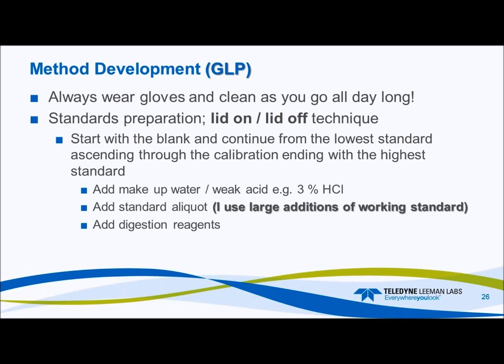GLP, so we always wear gloves and you clean as you go all day long. And I use a very simple technique for preparing standards. I call it the lid on, lid off technique. And I start with the blank and I continue from the lowest to the highest. So I'll add my makeup, whatever I need to bring it up to volume. Could be a weak acid or so forth.